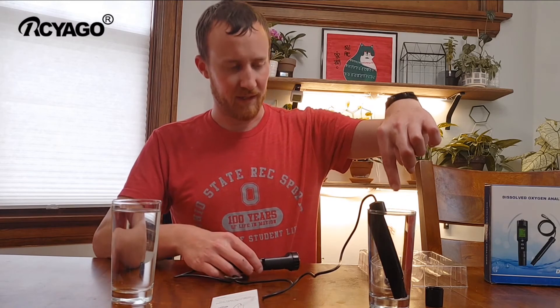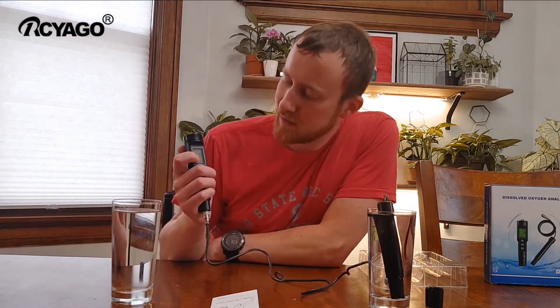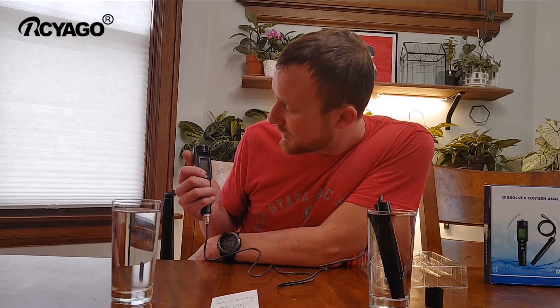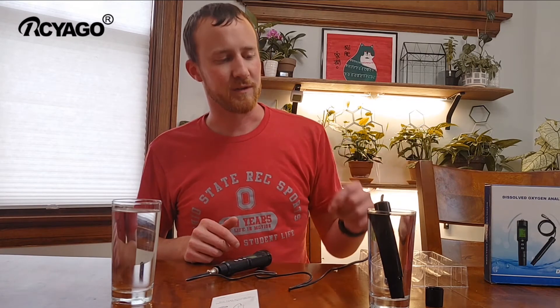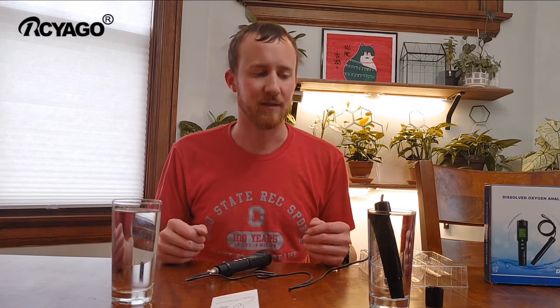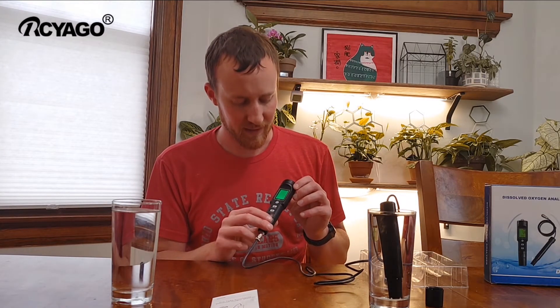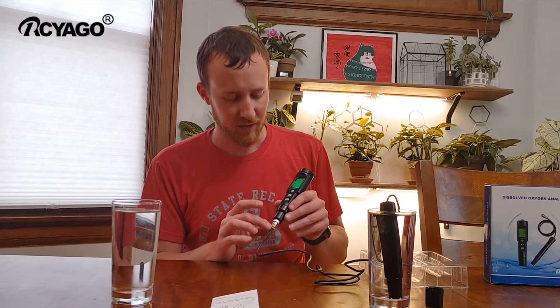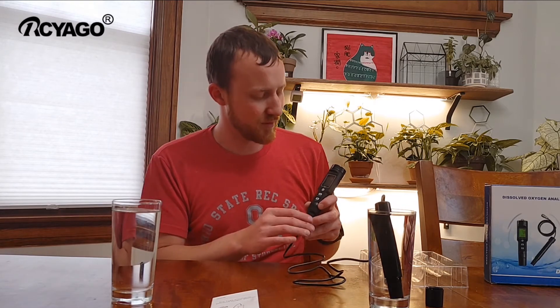The electrolyte solution goes on the end of the membrane. This water was boiled yesterday or the day before, and you can see the oxygen has gone down — I'm down to 7.5 milligrams per liter or 81%. I believe it was about 83% before, so it is going down once I put it in the boiled water, which is exactly what I'd expect, because boiled water holds less oxygen than normal cold water. The colder the water, the more gas it can hold. I'm going to be trying this out for brewing, but initially this looks like it's measuring at least directionally properly.